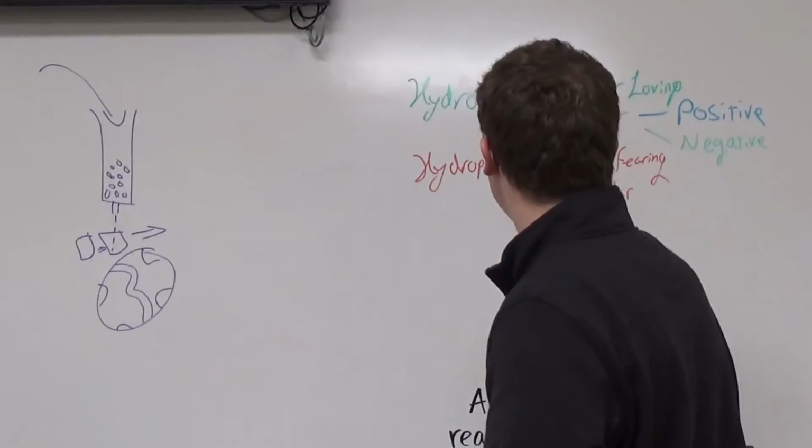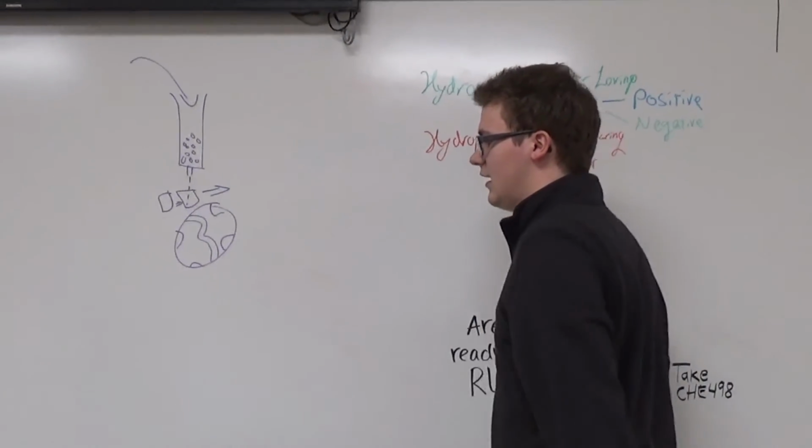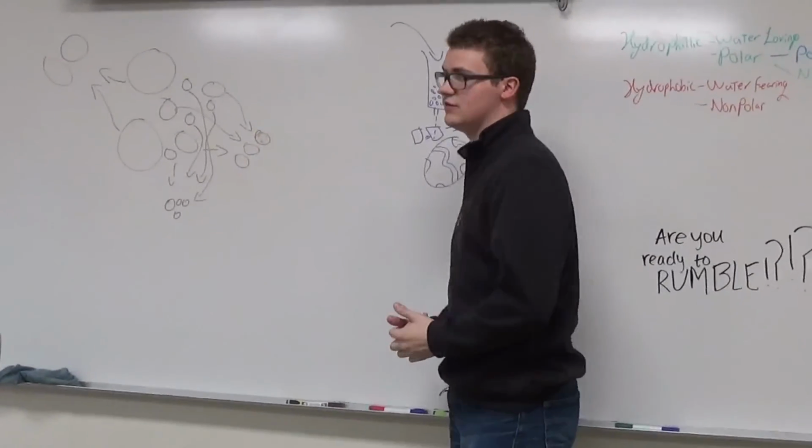So hopefully this has been able to help you get started with understanding chromatography and how focusing on the strengths and the differences of molecules actually pays off really well in this case.